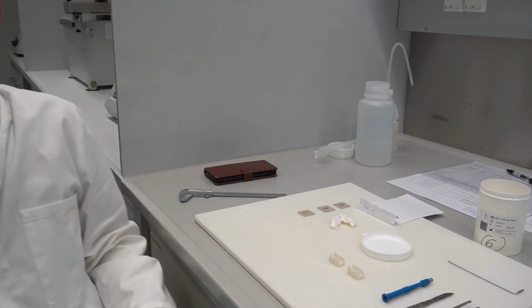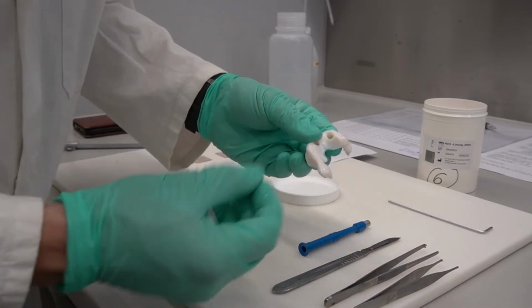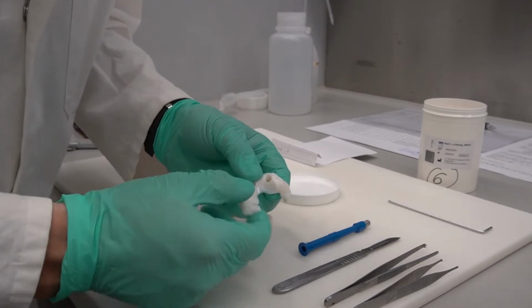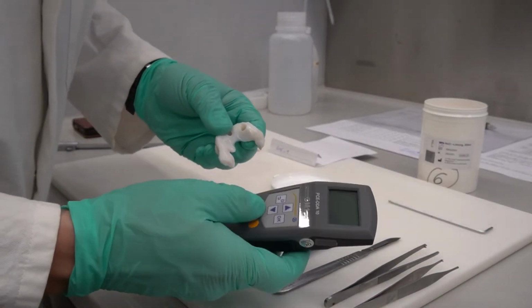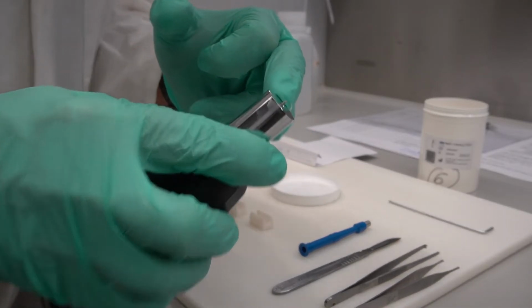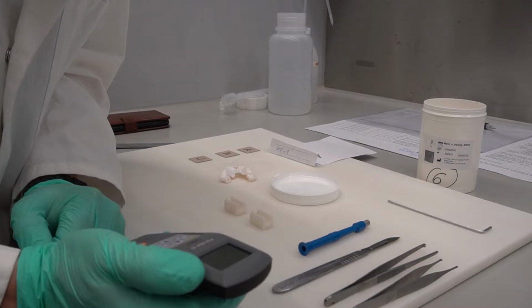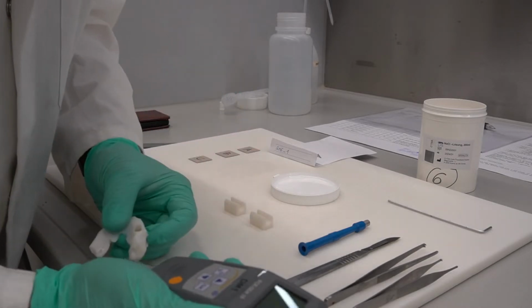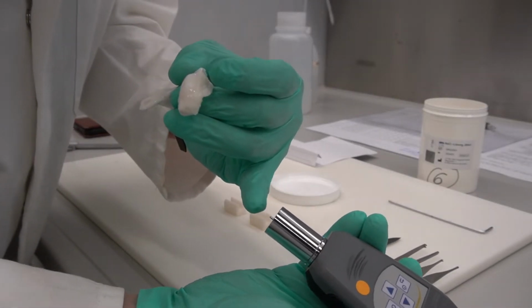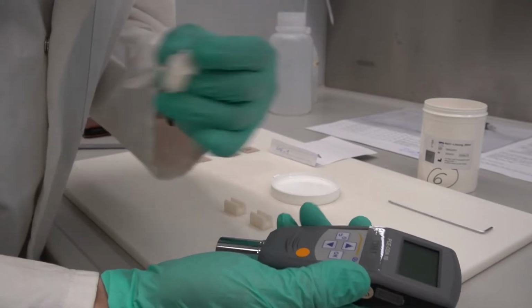Let's go. I will now extract a 3rd cylinder out of this meniscus, but first I will measure the shore hardness, which is also another type of material property. I have here a shore durometer, which is working like this. You have a small indenter here at the end, a small tip, and you press this tip on the surface and wait for a few seconds, and then the device is giving you the shore hardness, which is basically related to the indentation depth of this pin. So the deeper it indents, the lower the shore hardness.